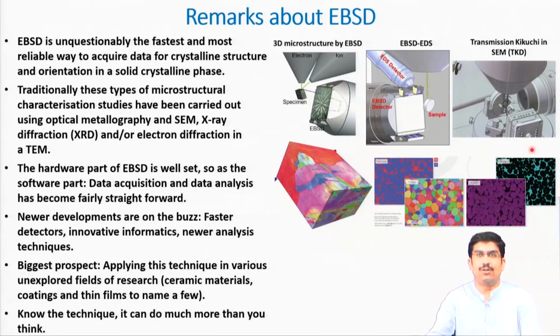Okay. Newer developments, as I said, are buzz, faster detectors, innovative informatics, newer analysis. And the biggest prospect, to me, and this is all coming out of my experience of working with this technique over 15 years now, is applying this technique in various unexplored fields of research, like one example I have given you, ceramic materials.